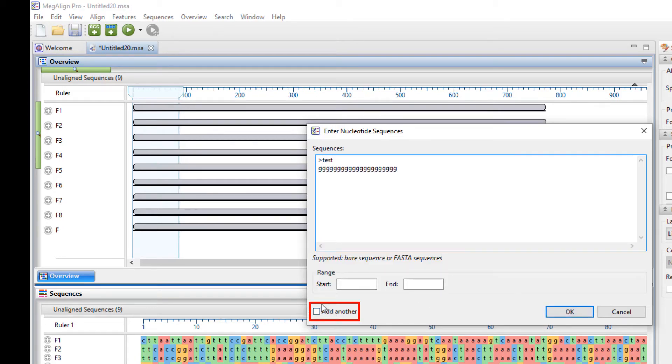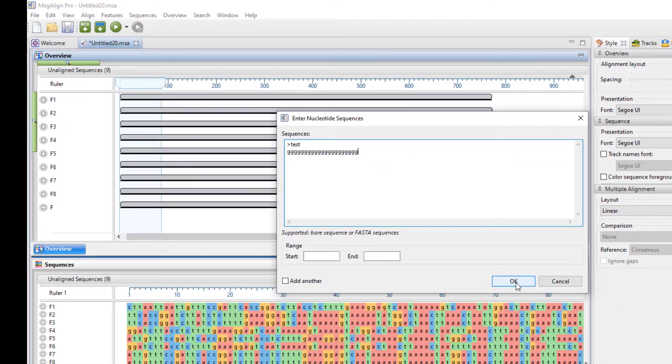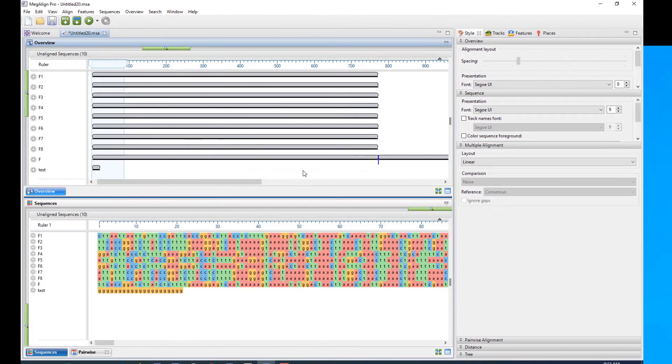And again, if I wanted to add additional samples, if I was going to go through a series of these, I can leave this checked. I'm going to leave it off. And my sample is brought in.